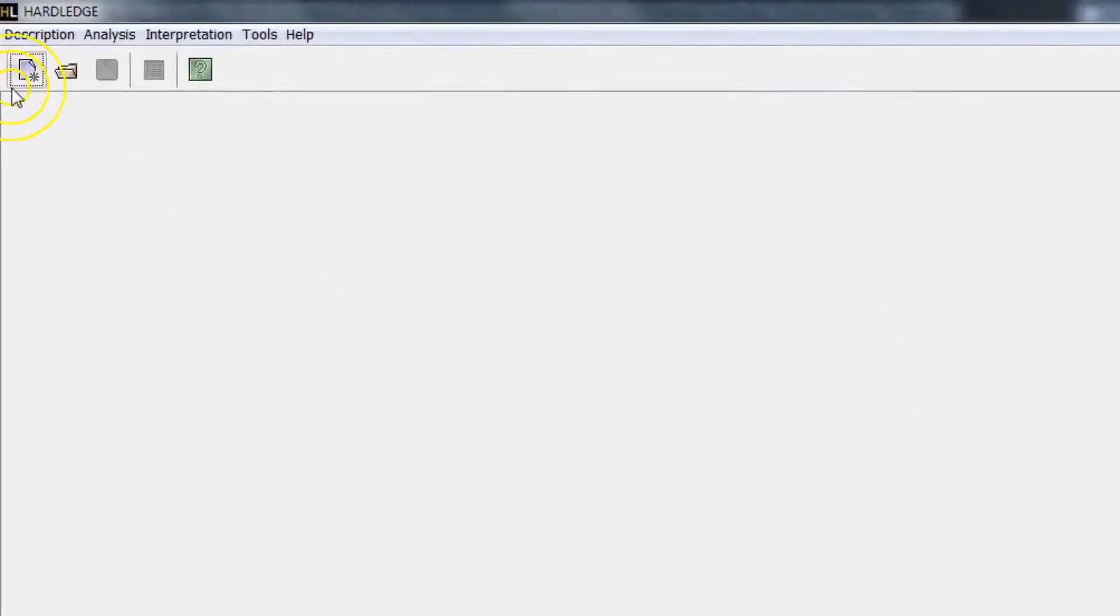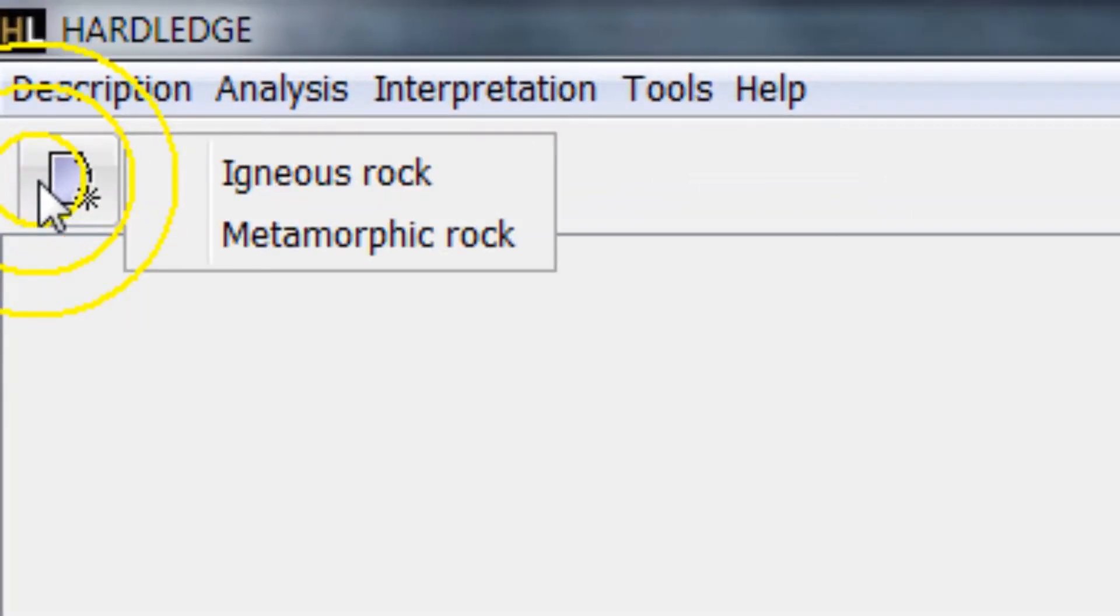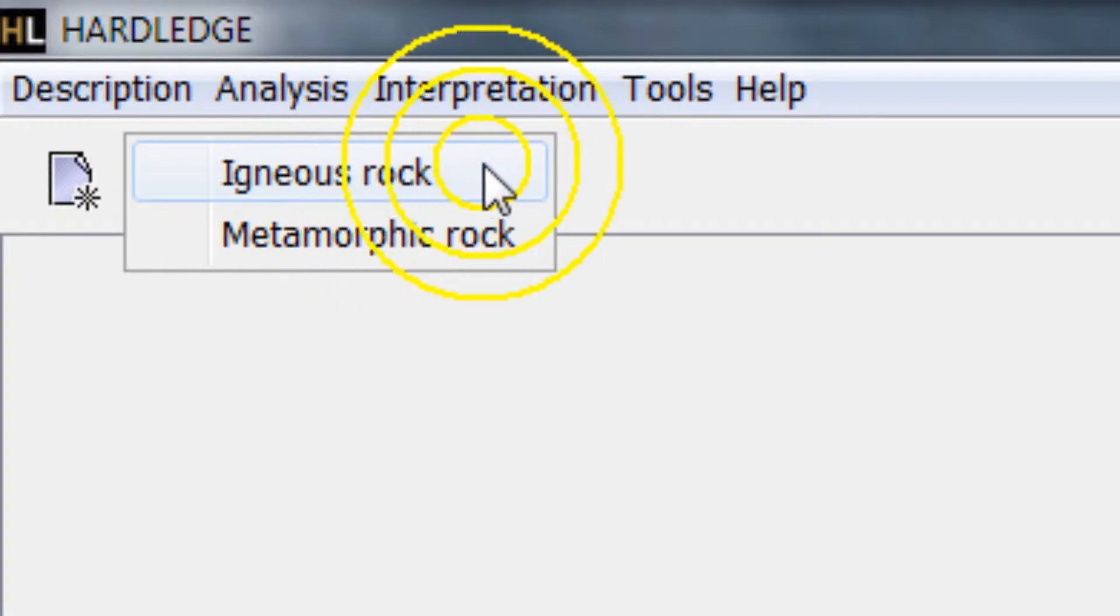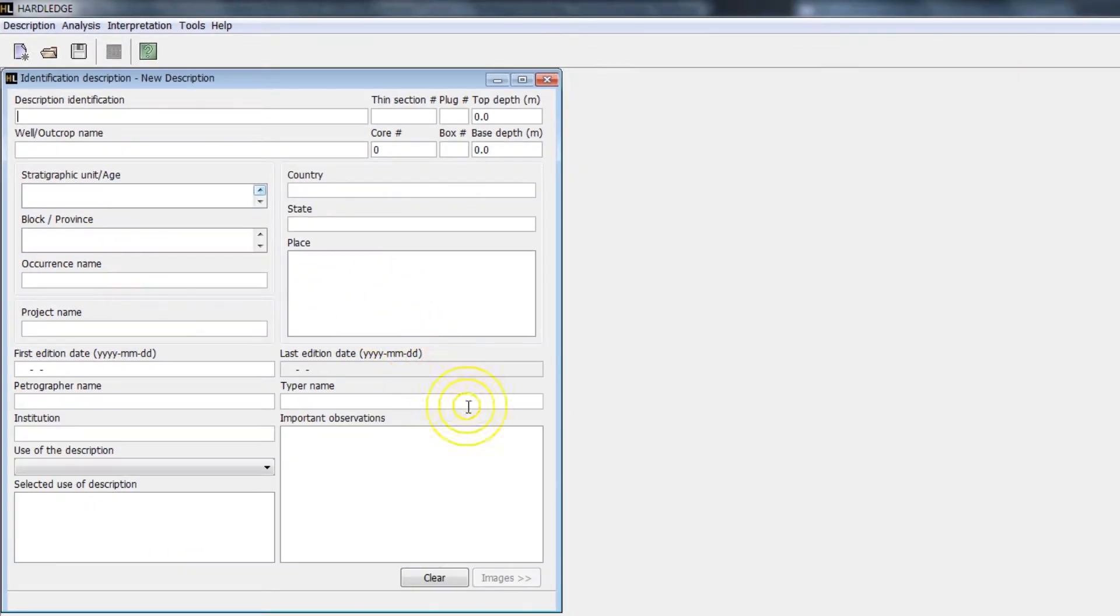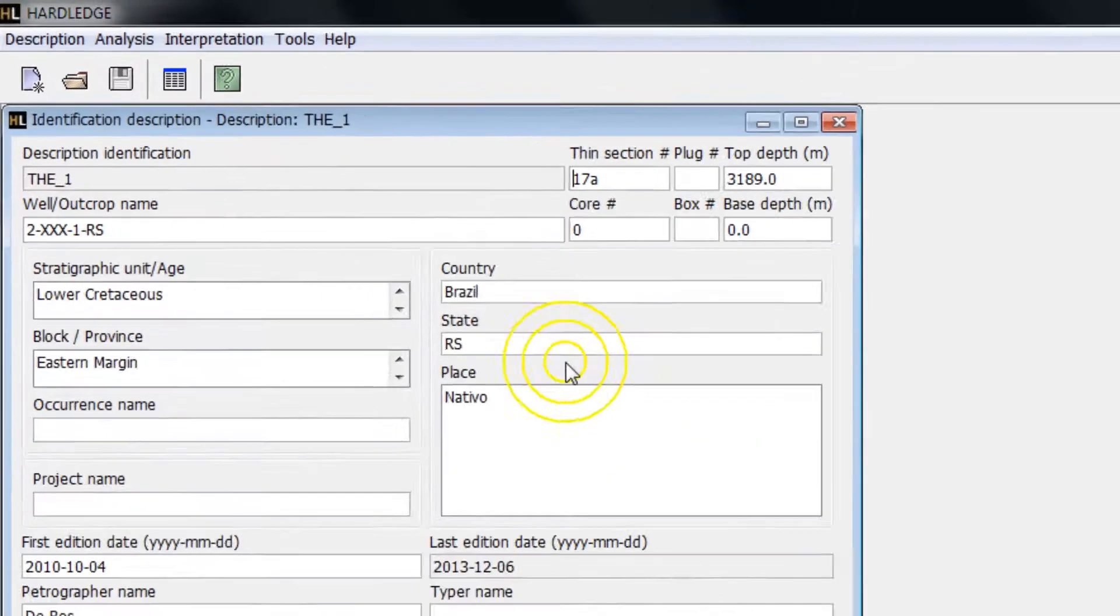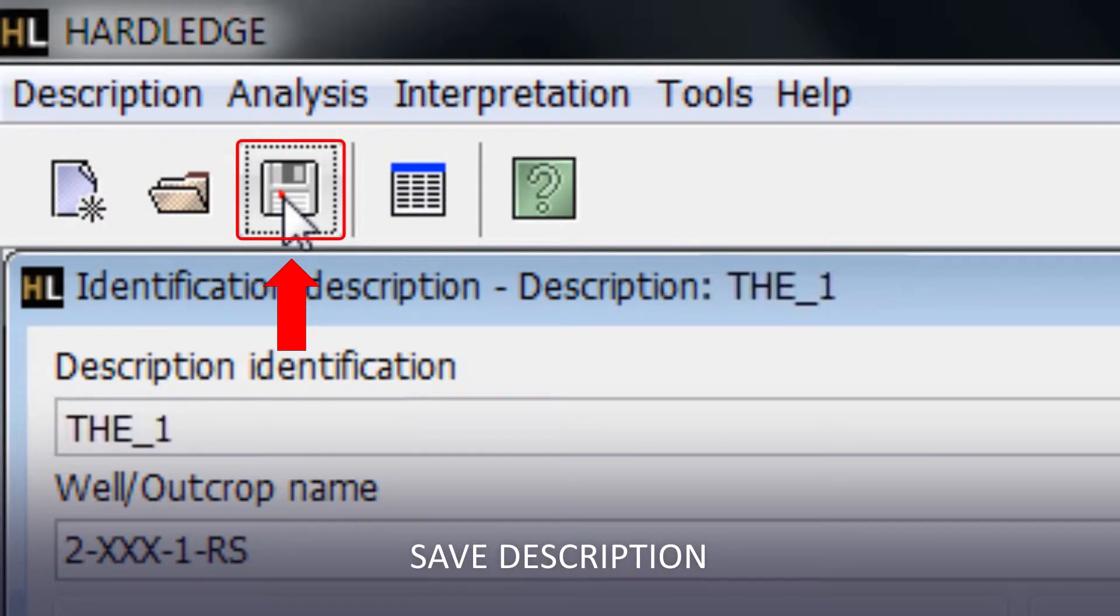To start a new description, click on the New Description toolbar icon. Select between Igneous Rock and Metamorphic Rock. The identification screen will be shown. Filling the Description Name field is mandatory. To save the new description, click on the Save icon of the toolbar.